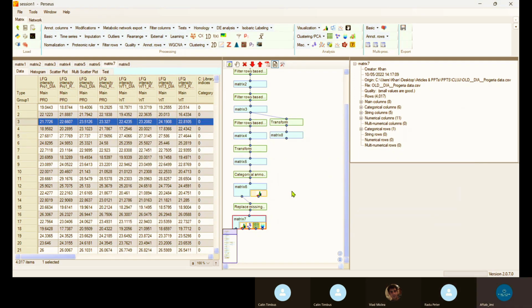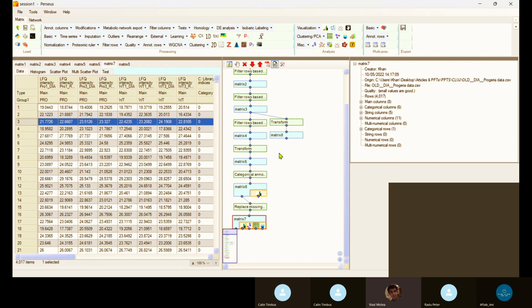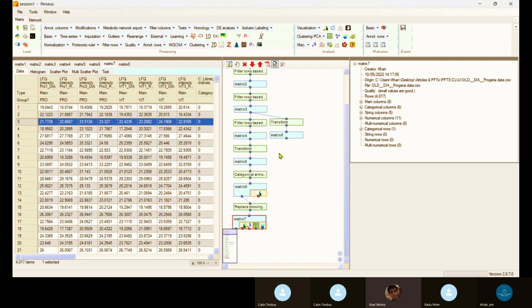So this is the overall basic introduction to Perseus. Any questions from this? No, but it's a great software. Yeah, it's great software, and we can analyze transcriptome data too with it. It incorporates a lot of what we did for pre-processing and imputation, because we were working on imputation, and all of this can be done with simple clicks, and then we get the data we want for testing the imputation. Even integrating our own imputation method is really easy. Great stuff. Thanks for showing it.